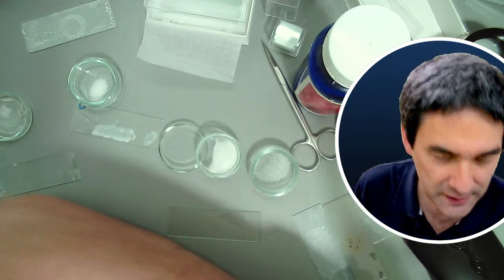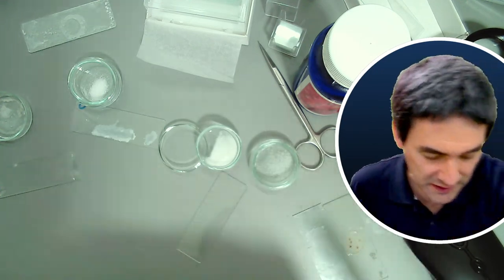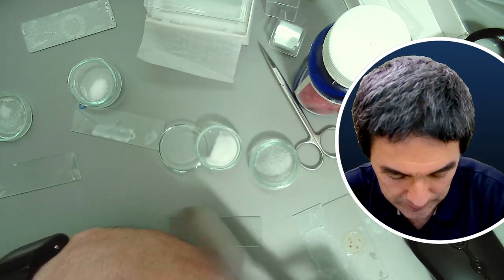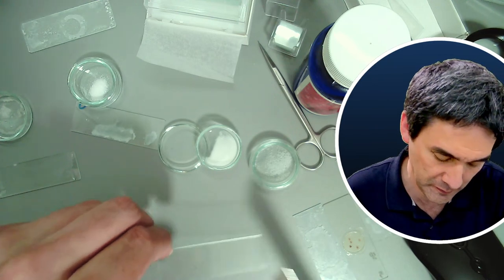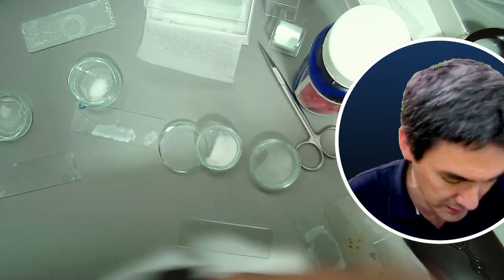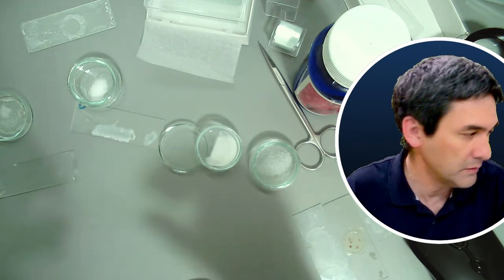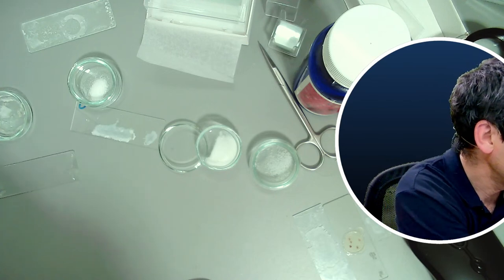Okay, so look, this is the way it works. You take a slide and scrape some skin cells off, hoping I don't see any. Yeah, maybe here. If not, then I might actually take some cheek cells from the inside. I don't see any. I don't see a lot here. Okay. Let me try again. So there could be a few. If there are a few, then this might be enough.